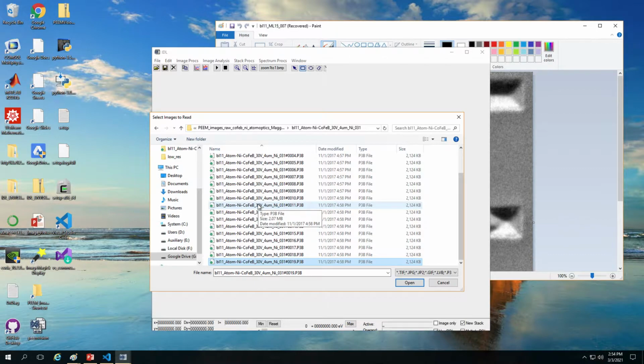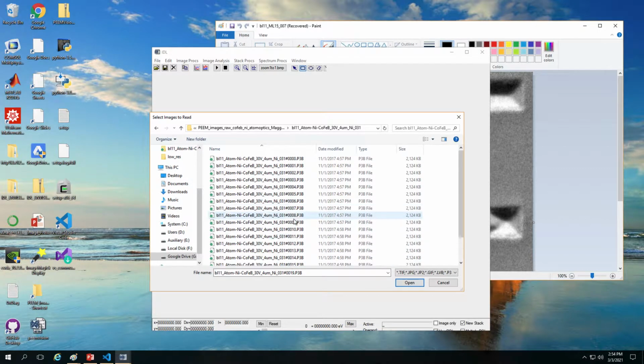Right now, if we have 20, we use 20 images for the high resolution and 4 images for the low resolution. If you have 40, I believe you could do 40 images for high resolution and 8 images for low resolution.